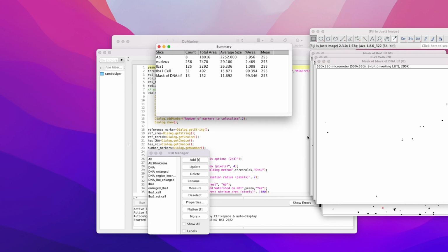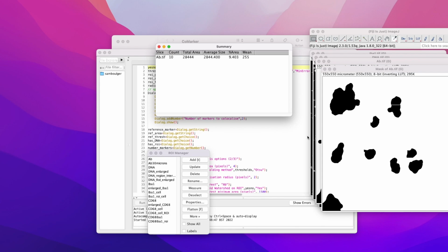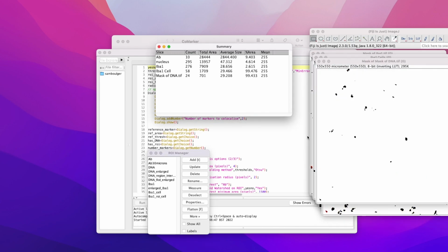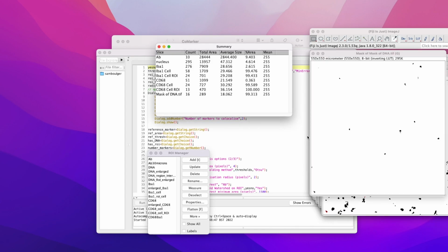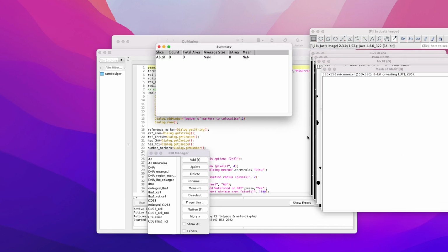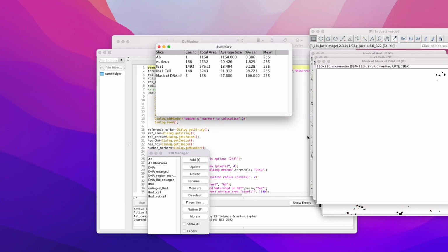This will tell you more about the exact steps that are taking place in this analysis, how we're counting cells, how we are classifying the region of interest, and the different optional functions that you can use. It's definitely worth a read. It can definitely help you make the most out of the script for your own personal use. It is important to understand and customize the parameters so that they work best for your markers.